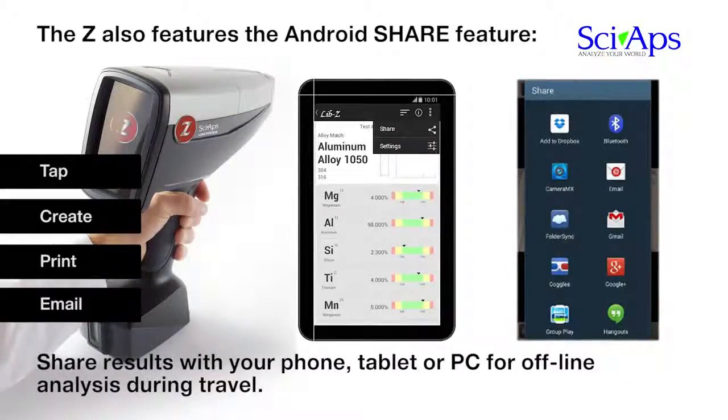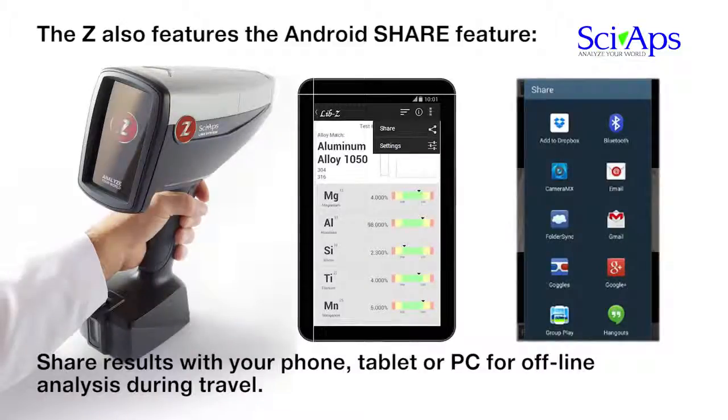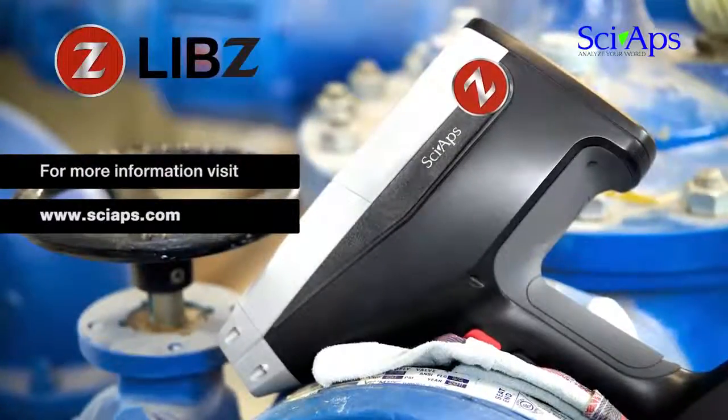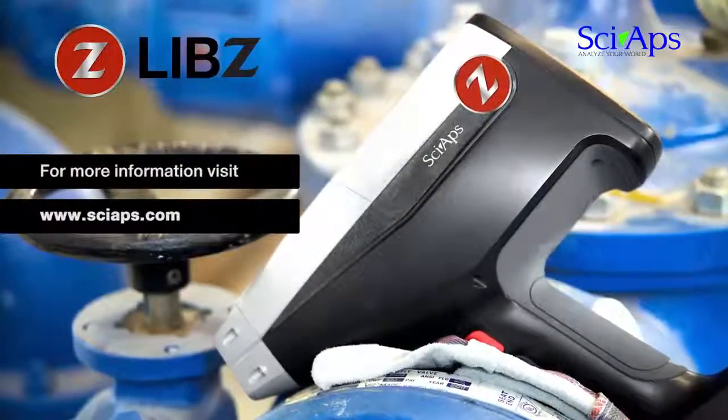Pick a device to immediately share data. For example, a wireless printer instantly creates and prints a sample test report in PDF format, or send the results to your smartphone or other cellular device and email it anywhere. For more information, please visit sciaps.com. Thank you.